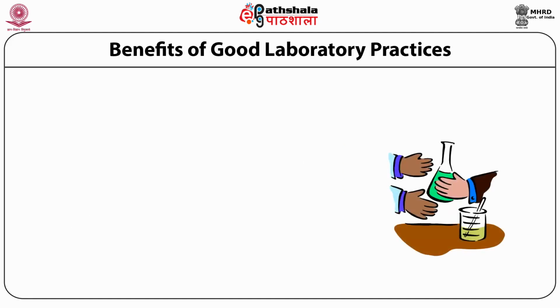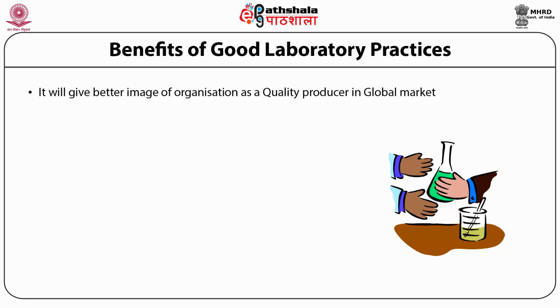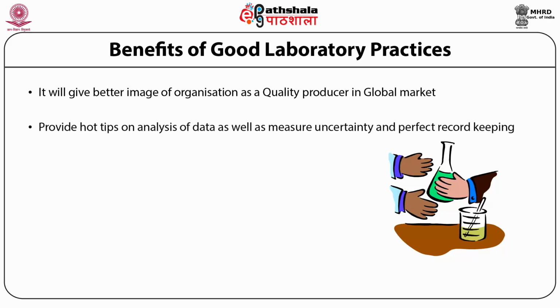So what are the benefits of good laboratory practices? If we follow the GLP, it can be very advantageous for our research work and our other laboratory processes, equipment and laboratory colleagues, as it will give a better image of the organization as a quality producer in the global market. A good GLP will provide hot tips on analysis of data as well as measure of uncertainty and perfect record keeping.